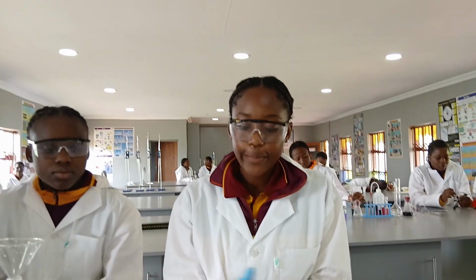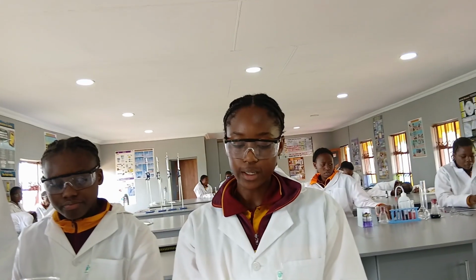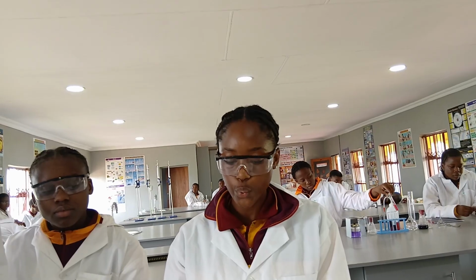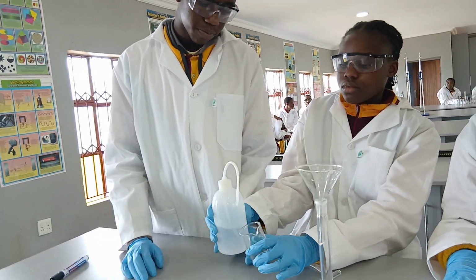The third step is that the solution will be transferred into a 250 cubic centimeter volumetric flask with the aid of a funnel. We have already done that. The fourth step is that the beaker and the glass rod will be washed with a small amount of distilled water and all the washings will be transferred back into the volumetric flask.